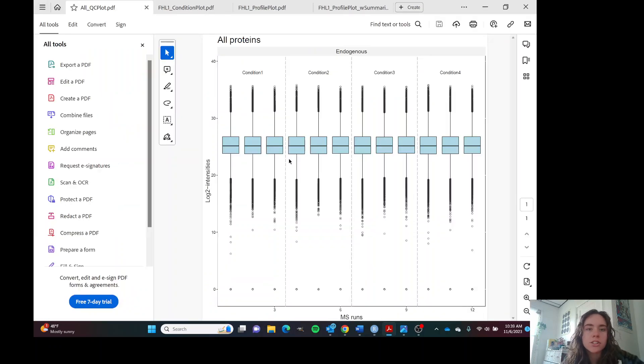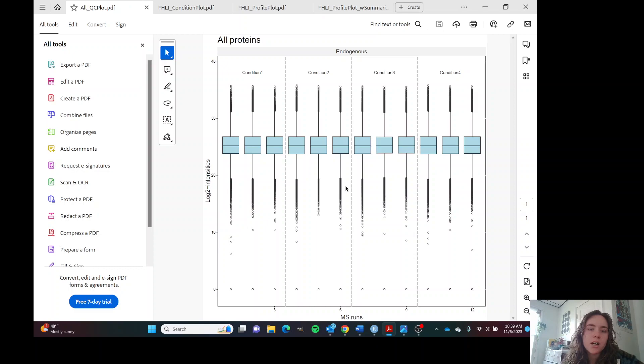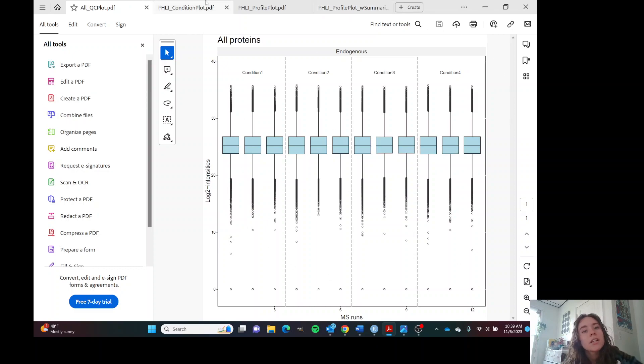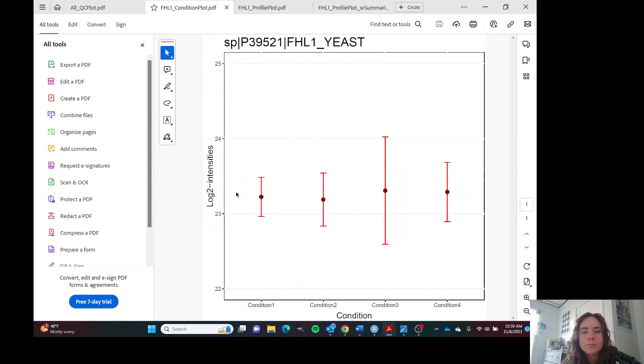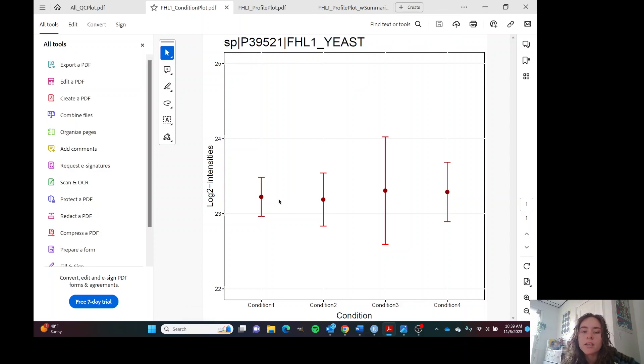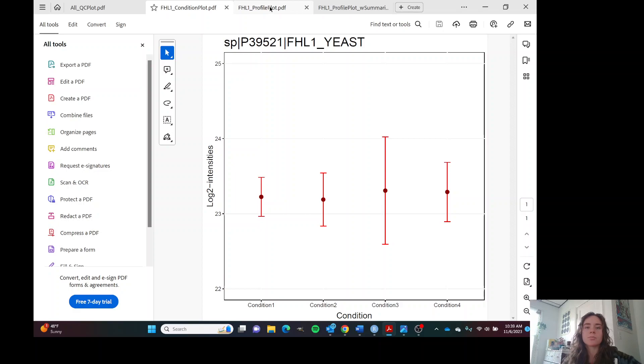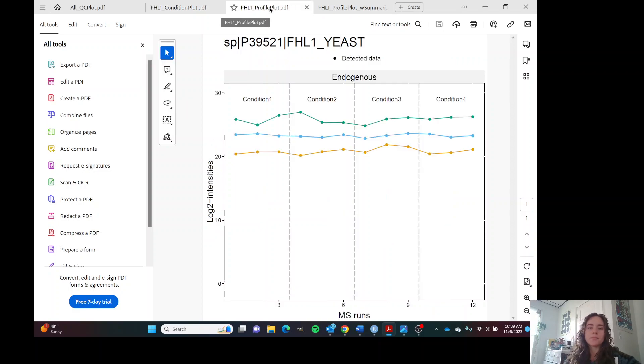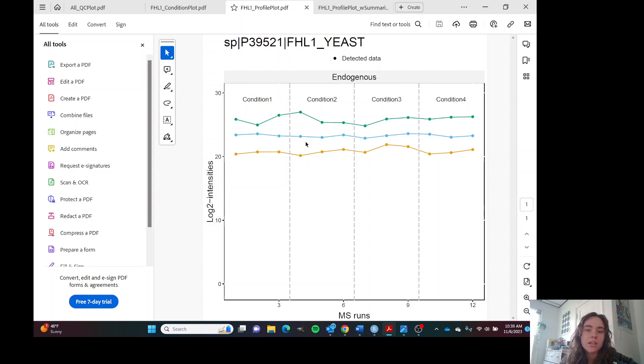This is our QC plot, which shows the equalized mean and shows that our normalization worked. This is our condition plot. I chose just this protein to look at. Looks like the expression of this protein is the same throughout all the conditions. And this is our profile plot, which shows the mean across all the runs.